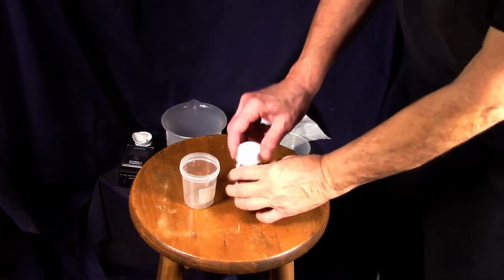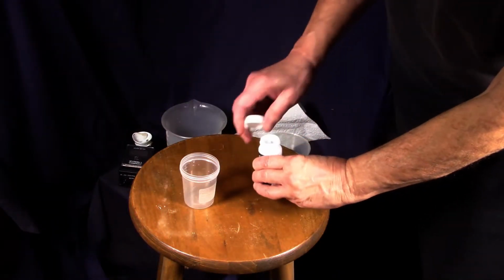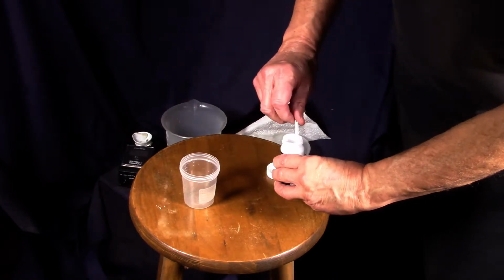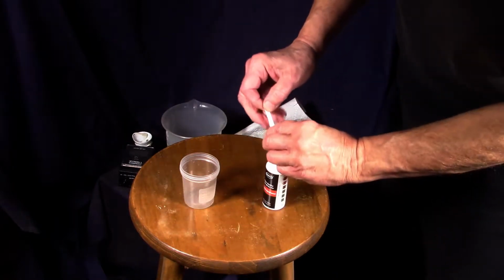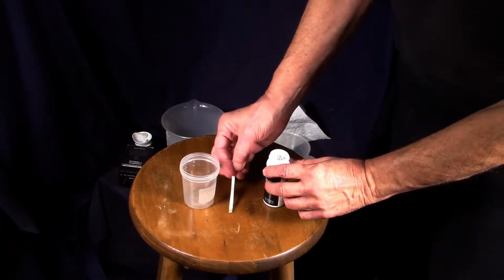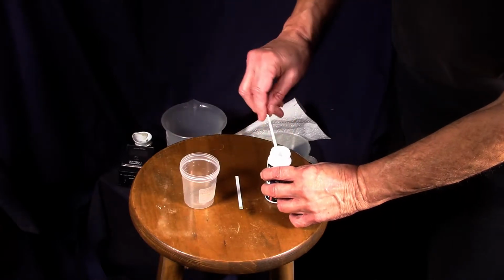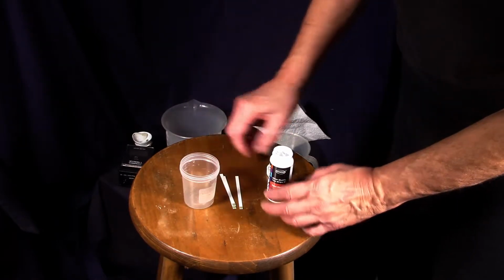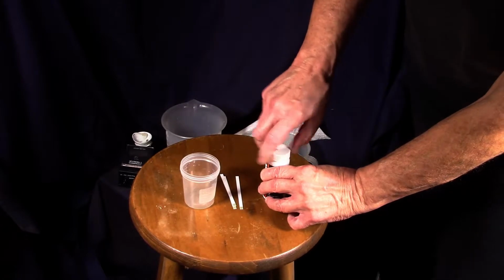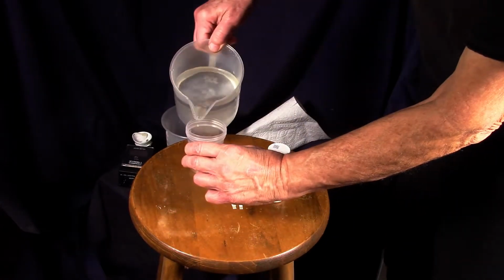This is a demonstration of the Hach Soft Check testing method. Within this brand new bottle there are 50 strips of test papers. These test papers have a gray-green chemical on the end that changes color to indicate the amount of hardness in the water. The gray-green indicates no hardness, and a deep red represents hardness.